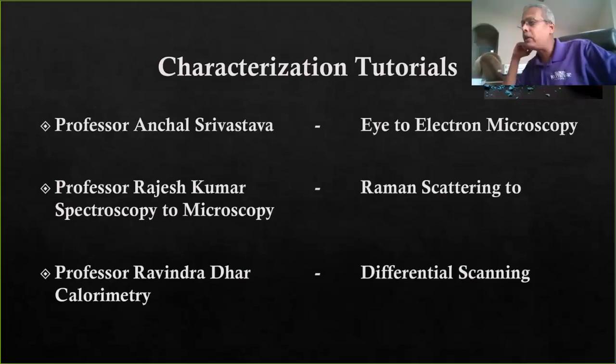And Professor Ravindra Dhar today was just amazing, giving an overview of how not to miss a peak, which is not a peak you can easily see in differential scanning calorimetry. That means you will easily bypass the peak, but you have to nail it down and then find out what that peak is meant for. Thank you, sir, for your vast energy and vast knowledge to share your characterization. So this is about characterization as a tutorial.